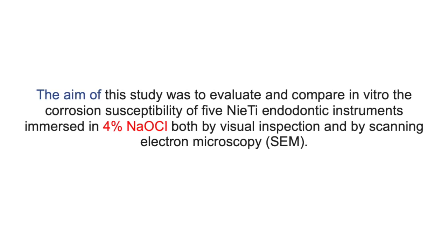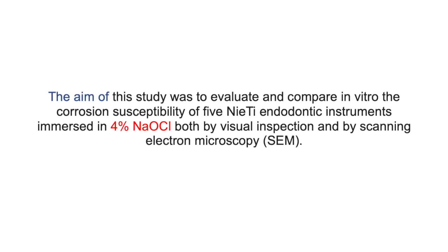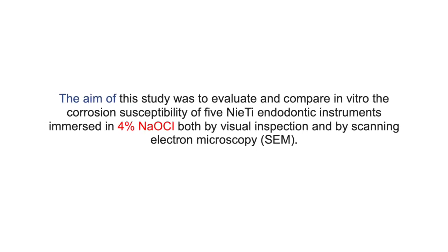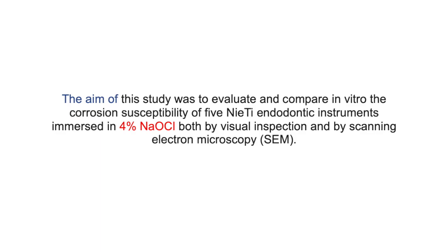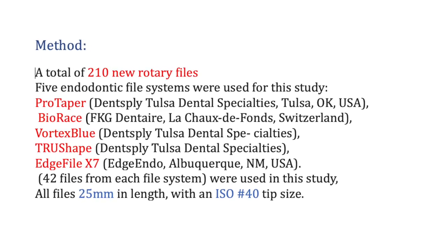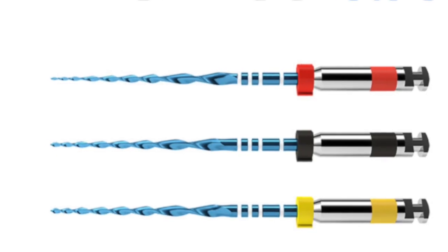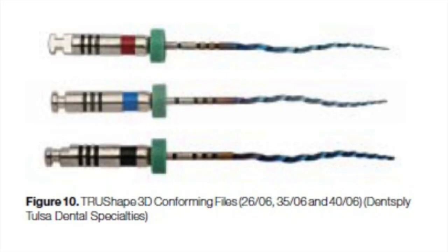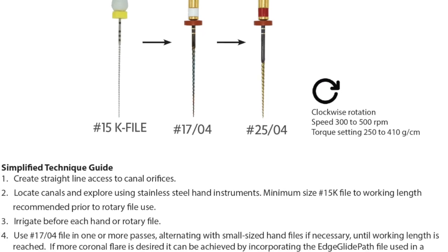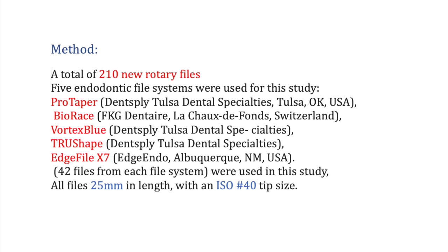The aim of this study was to evaluate and compare in vitro the corrosion susceptibility of 5 nickel-titanium endodontic instruments immersed in 4% sodium hypochlorite, both by visual inspection and by scanning electron microscopy. For this, a total of 210 new rotary files from 5 endodontic file systems were used: ProTaper, BioRace, Vortex Blue, TrueShape, and Edge File X7. 42 files from each file system were used. All files were 25 mm in length with a size 40 tip.